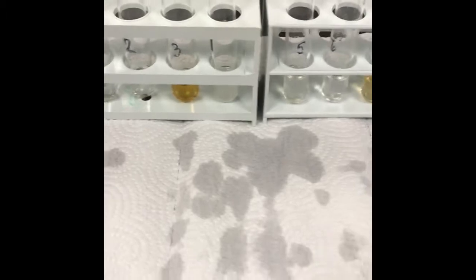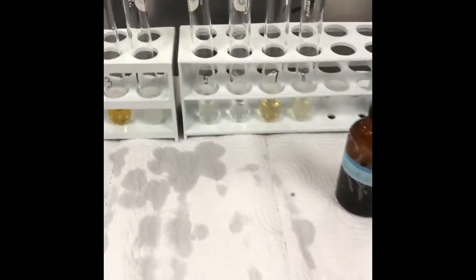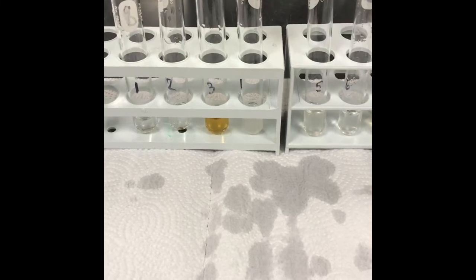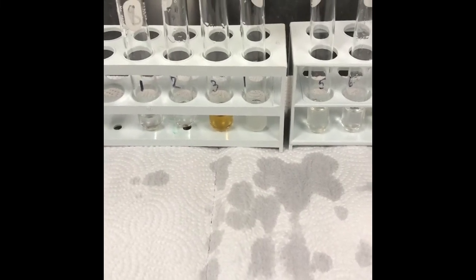So really quickly, this is a really cool one. I love this one. Benedict's reagent is going to react to a substance if it contains a reducing sugar, also known as a monosaccharide. For example, glucose, fructose, or galactose. Those are all 3 monosaccharides.